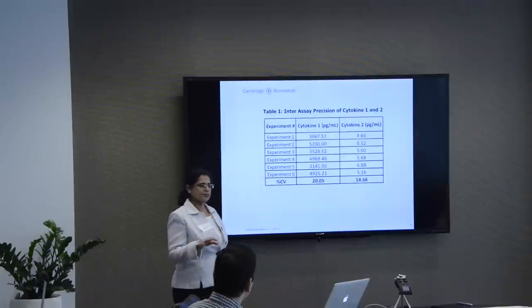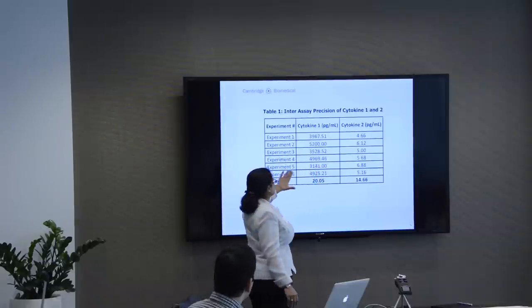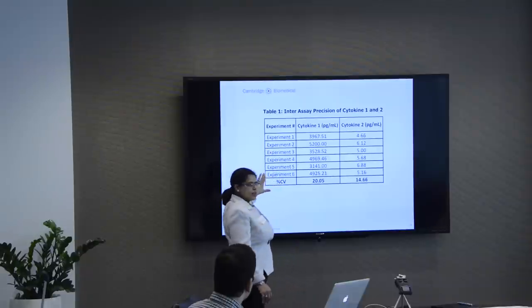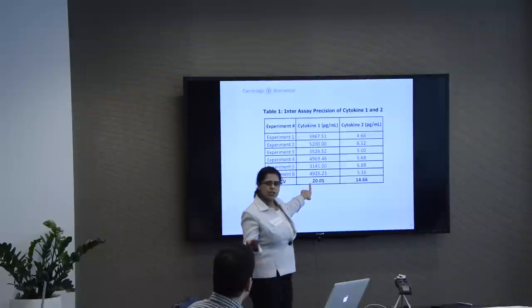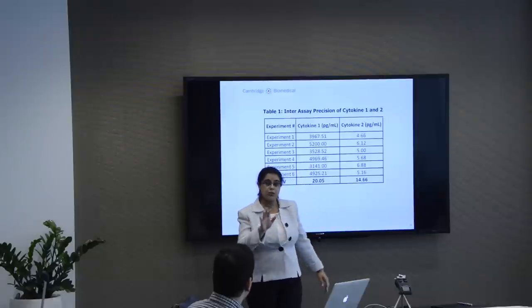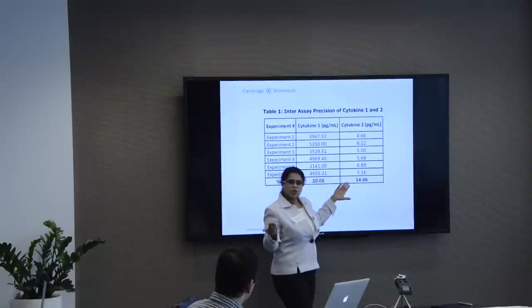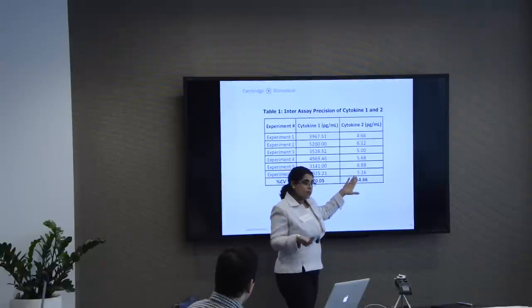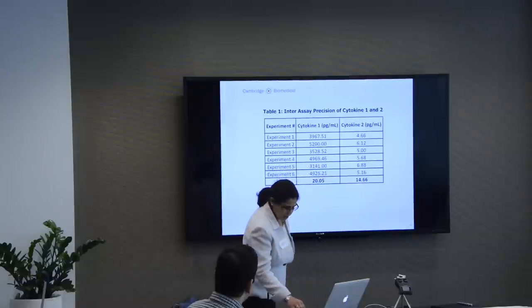Here's an example. The table shows inter-assay precision of cytokine 1 and 2. The experiment was done 6 times, different days, different experiments, 2 different operators. And look, cytokine 1, the precision is 20%. No, and the value is not even close to the lower limit of quantitation where it can be 20%. Cytokine 2, within that precision range of 15%. Can be, and most likely it is close. It is not the LLQ, but close to the LLQ. So well within that range.